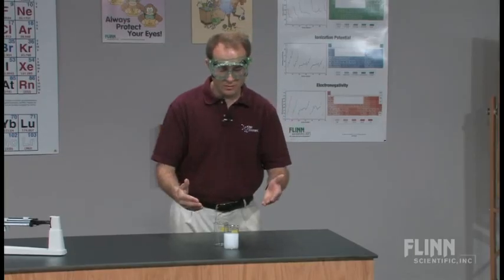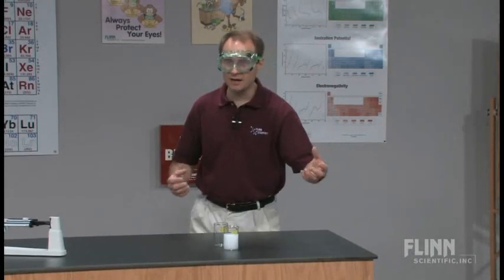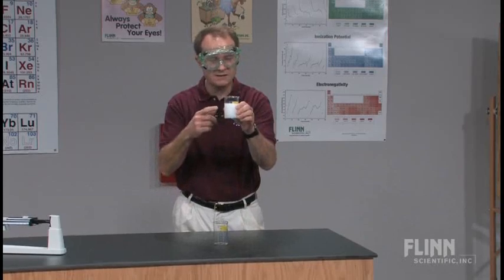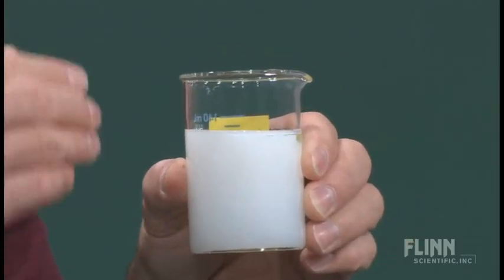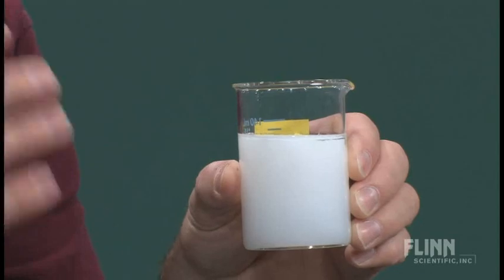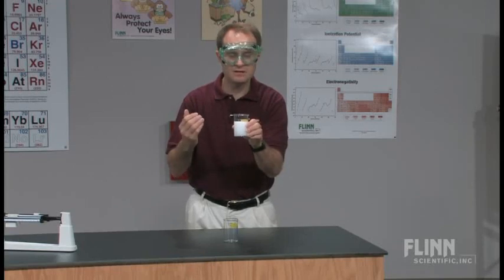But we would start with chemical change or physical change. Students would say, chemical change, and why is that? Well, you can't go back. Okay, what other evidence do we see? Well, we see a white solid substance. It looks chunky. I might walk out and show the students, yes, indeed, it is a solid substance in there. Chemical change, physical change.